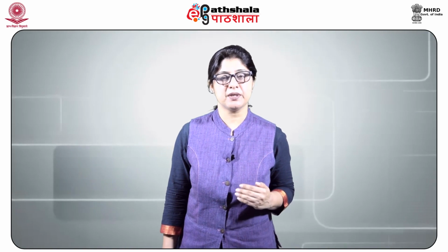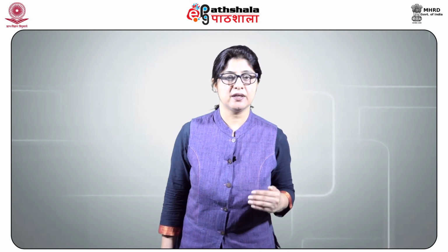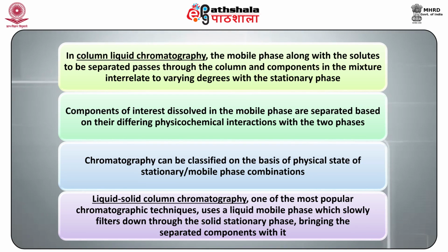or an immiscible liquid. Liquid chromatography is used for analytical or preparative applications. In column liquid chromatography, the mobile phase along with the solutes to be separated passes through the column, and components in the mixture interact to varying degrees with the stationary phase. Components of interest dissolved in the mobile phase are separated based on their differing physicochemical interactions with the two phases.